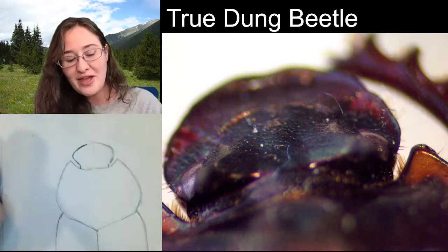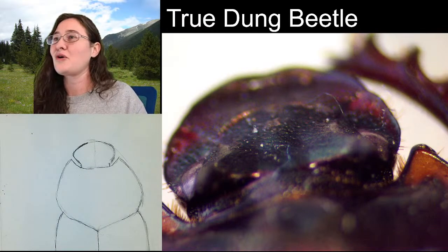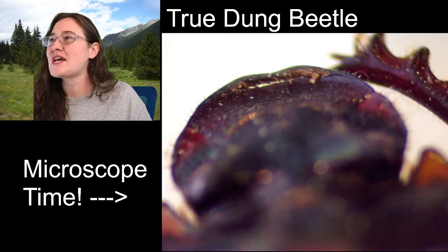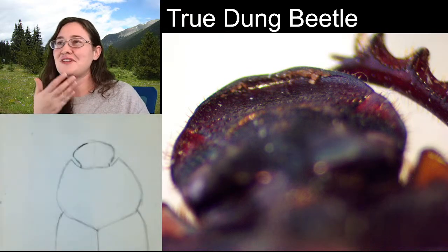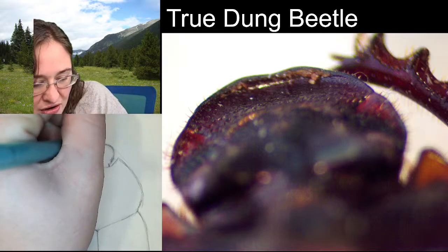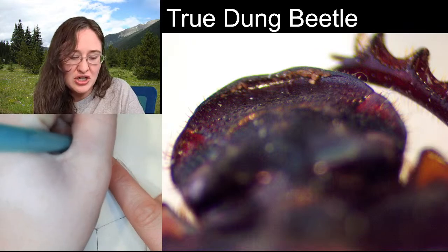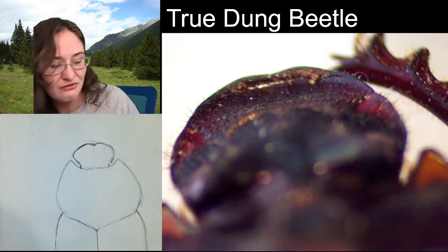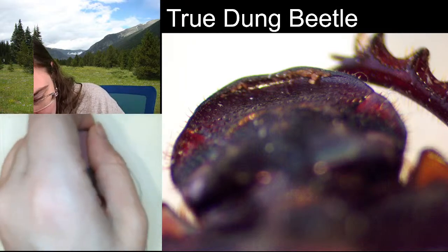And when we flip this beetle over and you see the underside of its mouth parts, they're awesome. I wanted to just focus down a little bit so you can see that it's not a cleft in the lip, but you can see that little arch or that little cutout. So once you get up to a point like this, you want to make sure you start a really slight U right here in the very center. Stay true to the specimen.